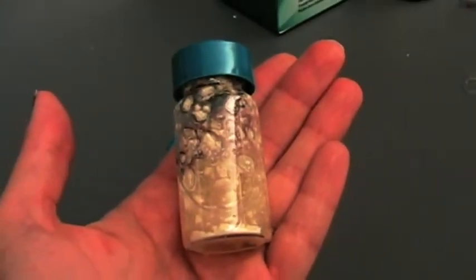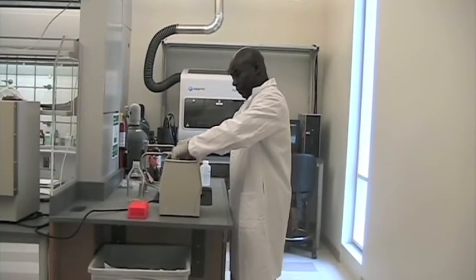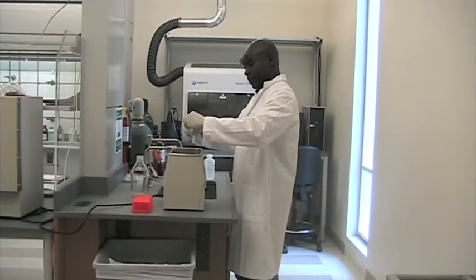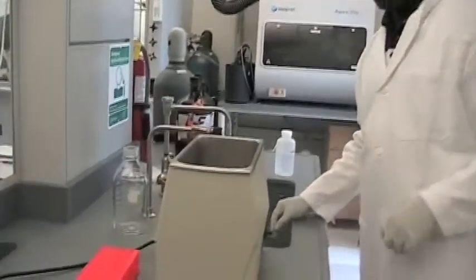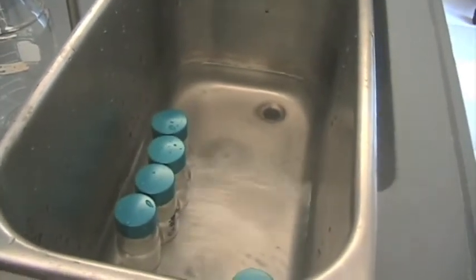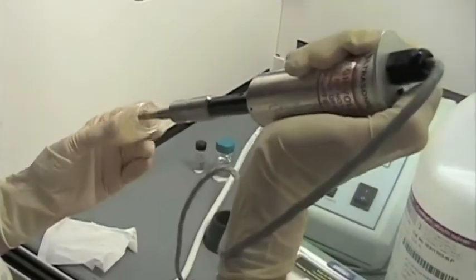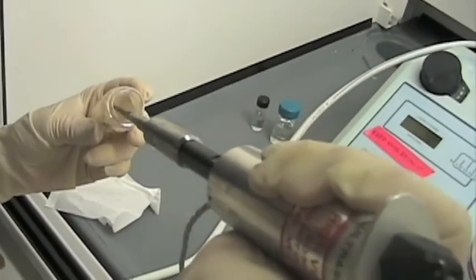It is not very well dissolved. So I'm placing them right now in the sonicator to help dissolve it thoroughly. There they are sitting in the sonicator. This is a heavy-duty sonicator that we use when the gels aren't very well dissolved to dissolve them a little bit better.